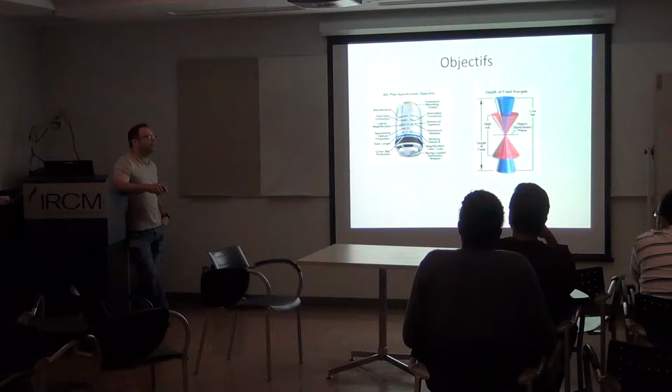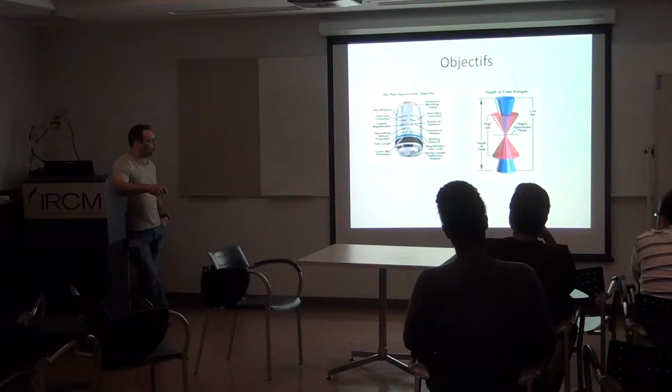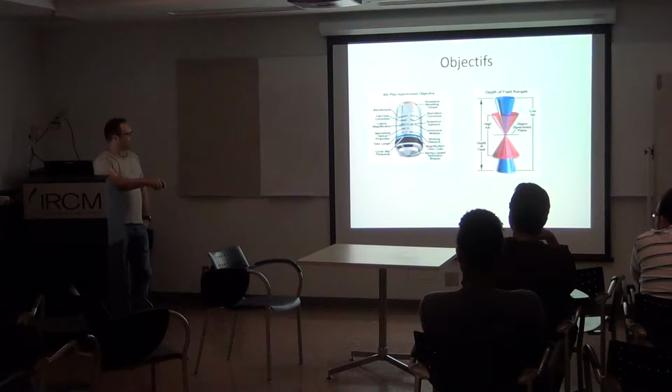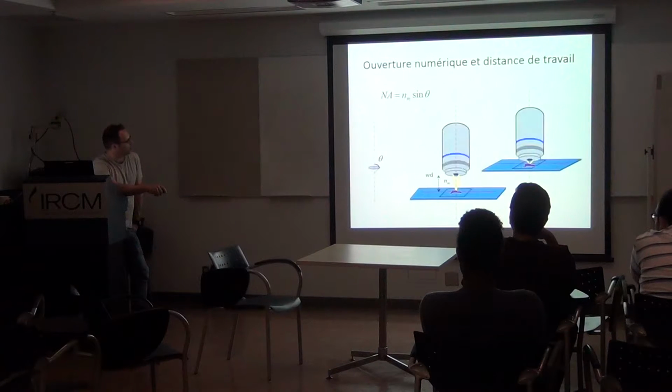So the higher this number, the more resolution you can have. And this number will also tell you if you need an immersion medium or not. At least, it gives a certain indication. Because numerical aperture is, actually, yeah, that's the definition here.